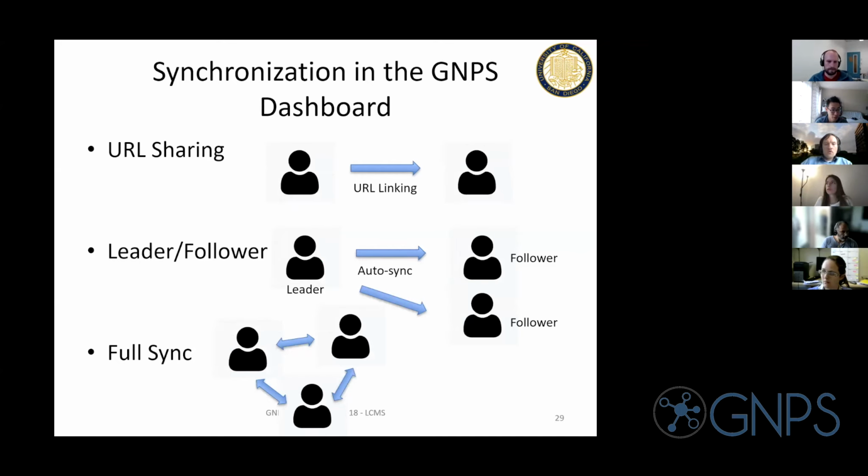You need to run a molecular networking job, or there's actually a summary workflow that makes it easy to pull it in. This is basically a privacy measure. You can visualize private data only if you run an analysis on it. The reason we do that is if you run an analysis on it, that means you have access to that private data. So there's kind of an access control layer, and then we allow you to visualize it. Anyway, that's a thing that we've done.